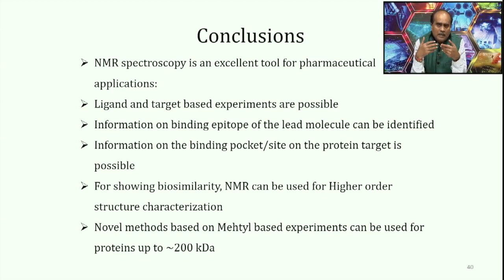So towards the end, I would like to convey this message. NMR spectroscopy is an excellent tool for pharmaceutical application. You can do lots of things like ligand based, target based experiments. You can find an epitope, which I did not show today, but you can find an epitope from the protein. You can find a binding pocket using NMR.